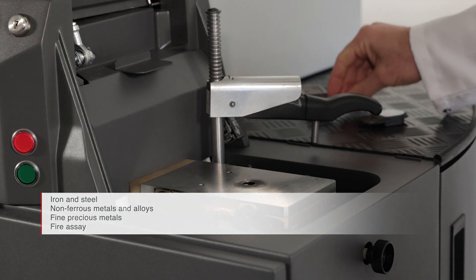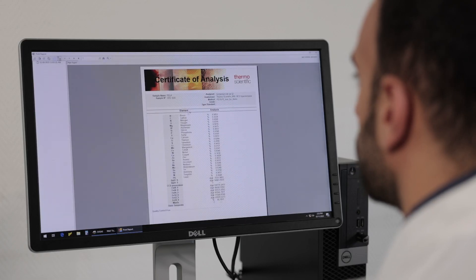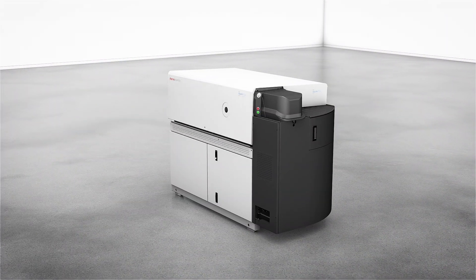In addition, the ARL iSpark Plus has an unrivaled capacity for ultra-fast analysis of non-metallic inclusions.